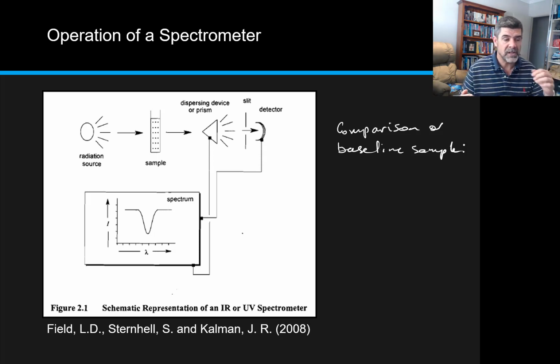This just gives you an idea about the types of outputs we get, and again try to draw comparisons between this principle of UV-vis and what we've seen so far with spectroscopy in terms of flame tests and colorimetry. It's all the same, it's just different wavelengths of light being absorbed and therefore exciting electrons. Sometimes those wavelengths are within the visible spectrum, which means we can see it as a colour, or they are beyond the visible spectrum into the UV, and therefore they won't have a colour.